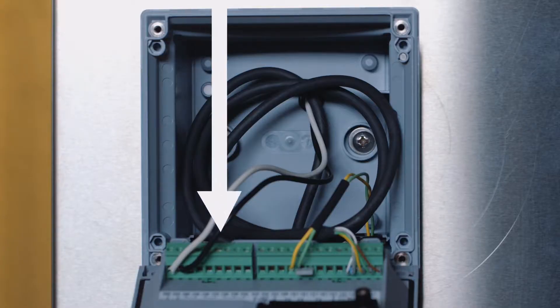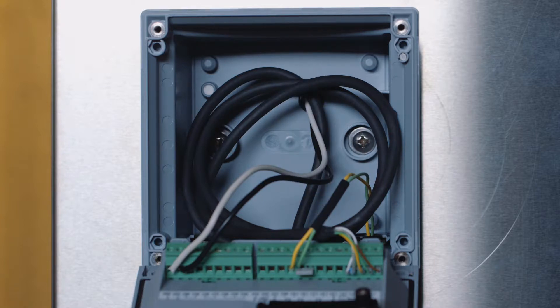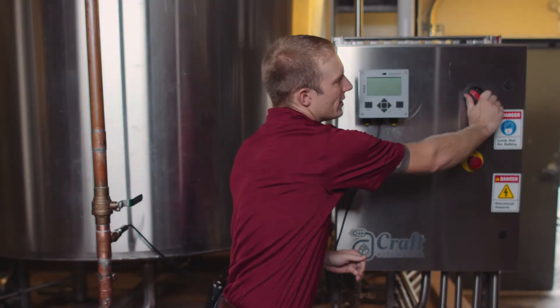Before you begin, ensure that your power supply, MemoSense sensor, and any outputs that you are utilizing are connected to the main terminal block on the transmitter. Let's get started by configuring your sensor within your Stratus Evo transmitter.